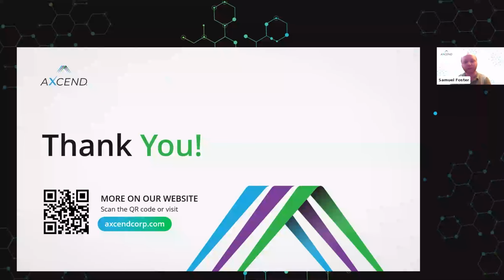In our case, we keep 25 micron ID tubing post-column, but 50 micron ID tubing pre-column, because any potential particulate would be stopped by the column there. And so you can get away with having narrower tubing post-column because it acts like a large filter.